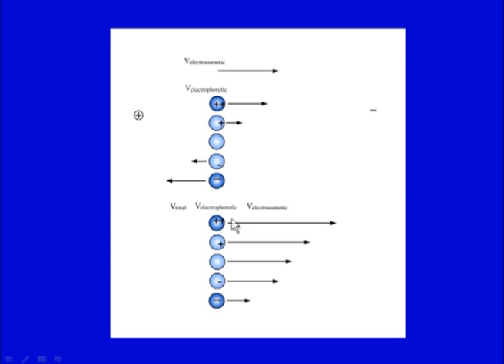The positively charged species in electroosmotic flow will move at the highest rate, followed by another positively charged species that carries less positive charge. Then it will be followed by neutral species, then negatively charged species: less negative charge will follow the neutral, and more negative charge will resist the electroosmotic flow, but still it will move towards the cathode with the bulk solvent, that is, the drag of the bulk solvent.